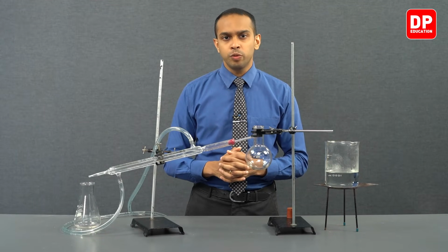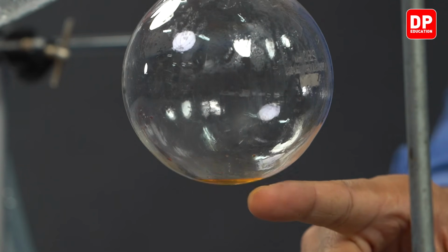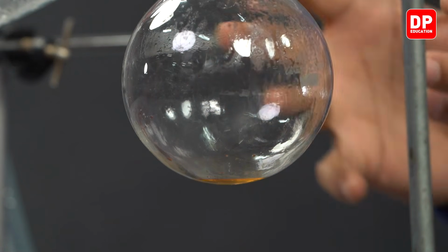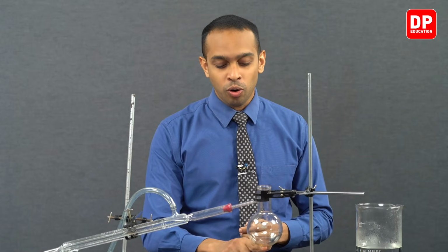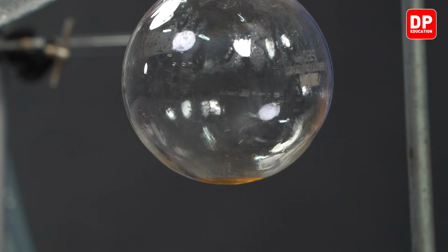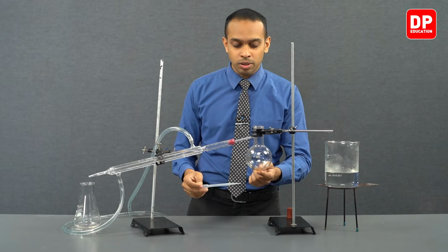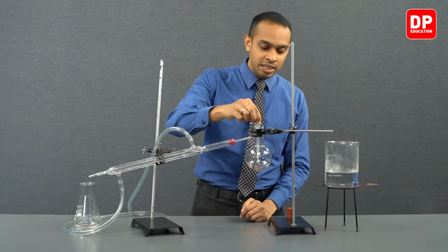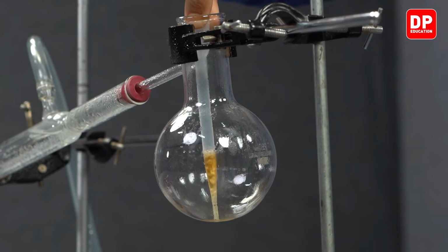Now students, after removing the steam bath, you can very clearly see the remaining amount of the essential oil that we extracted. So you can see, using 10 grams of cinnamon leaves, we could only extract a very small amount of this essential oil. We can observe this essential oil since it's at the bottom of the distillation flask here. Since we can't very clearly see it, we'll try to get it into a dropper here to clearly observe its color.